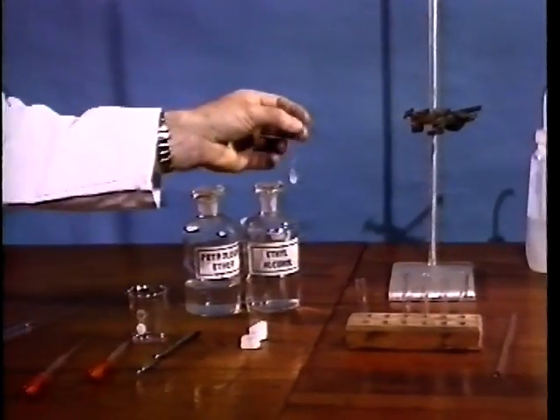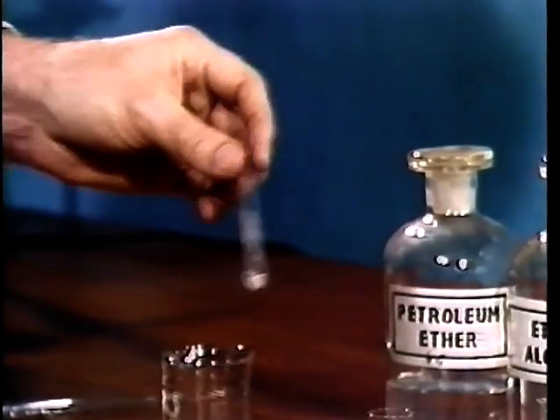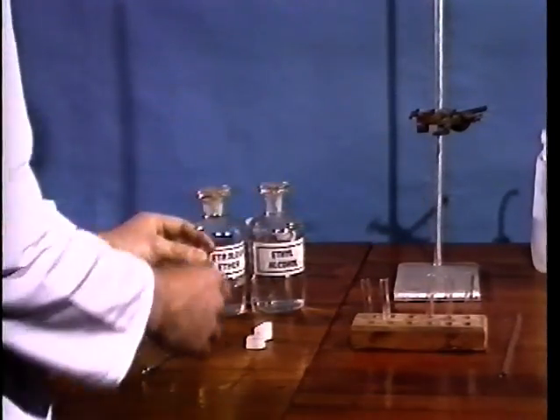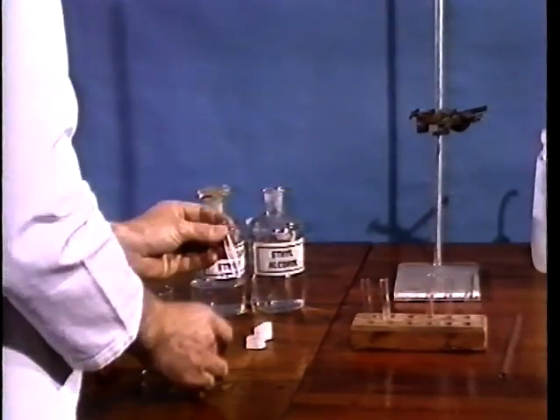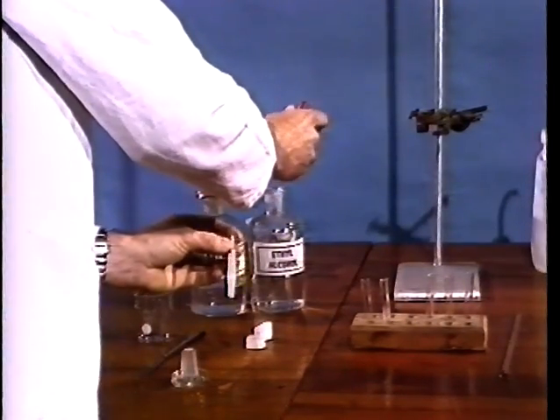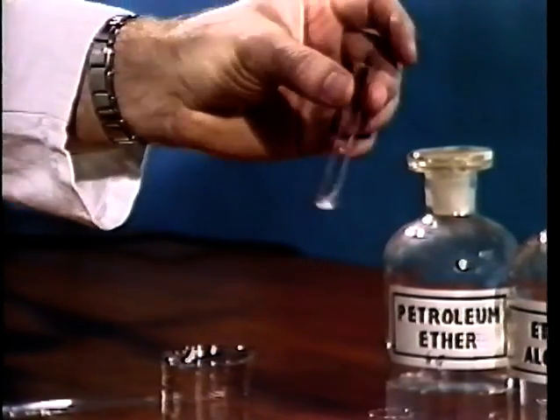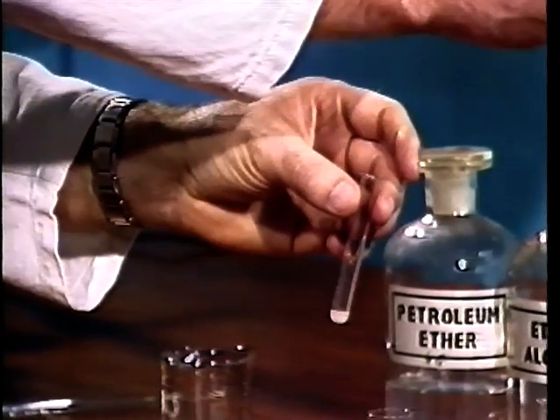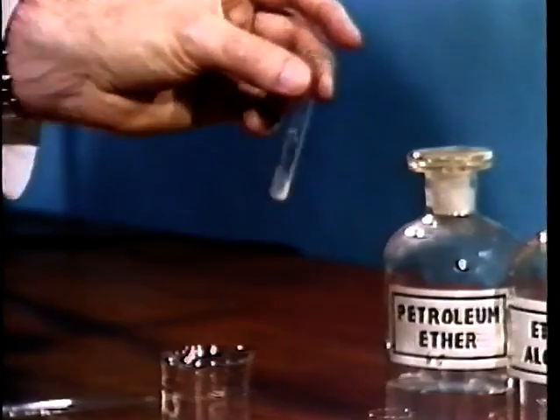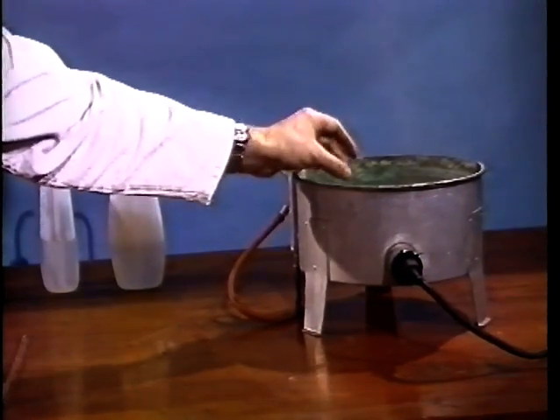To return to our other sample, if it is still insoluble even after boiling, then again this solvent is no use for recrystallization and must be discarded. Repeat this process with yet again a fresh pipette until you find a solvent in which the solid is insoluble at room temperature, but which dissolves on gentle boiling.